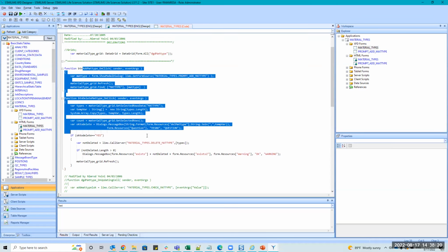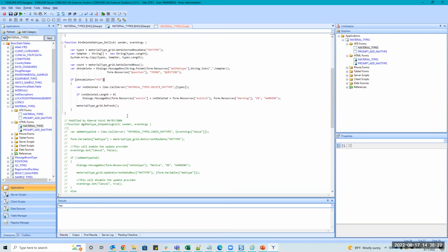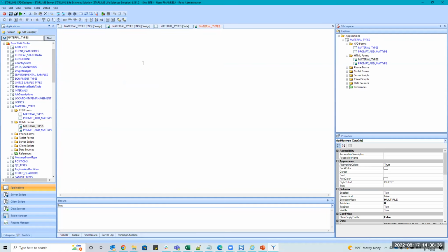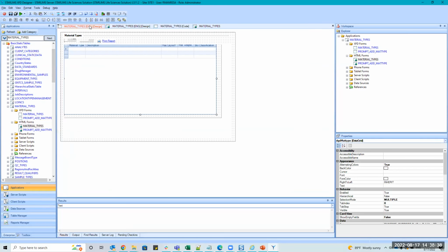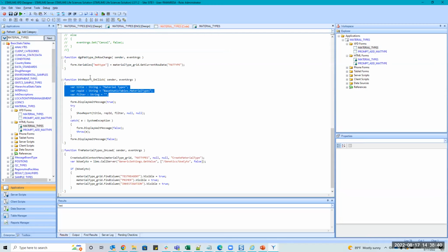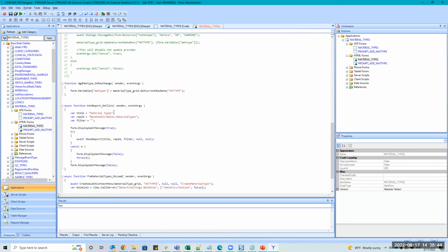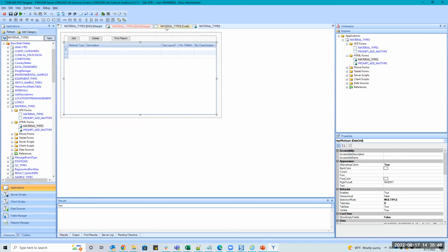You can see the code is very similar, but there's a call server, for example. There are some differences, right? And some key differences, like this right here, I can tell you it will not work in HTML. So if we look at the HTML version, it was under report on click. You see, that's one of the main differences.